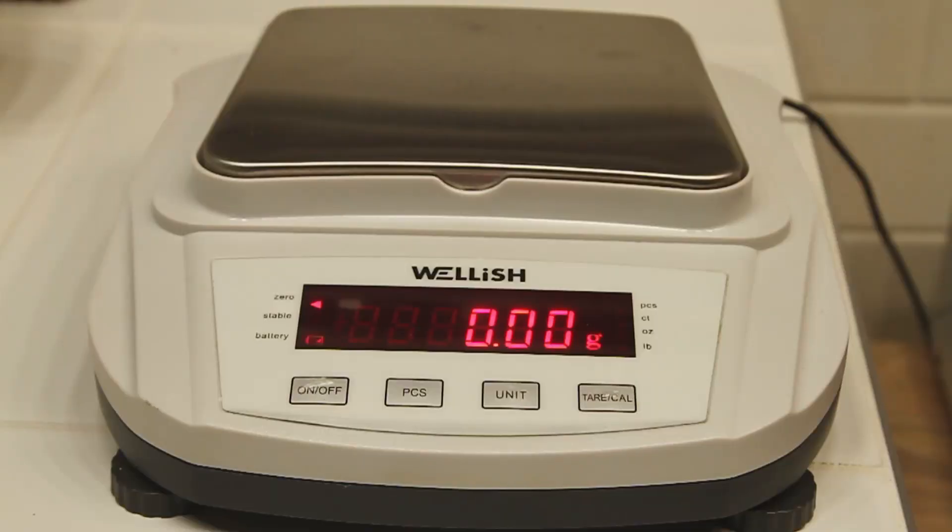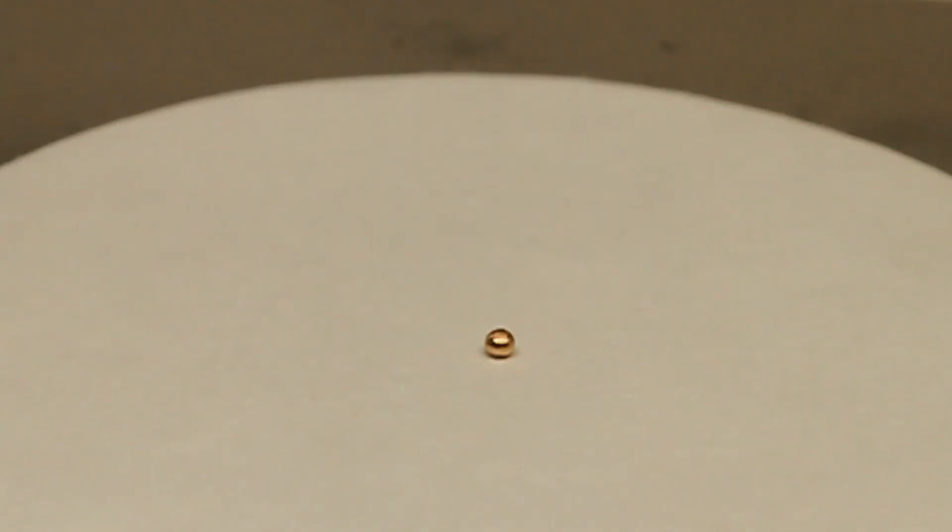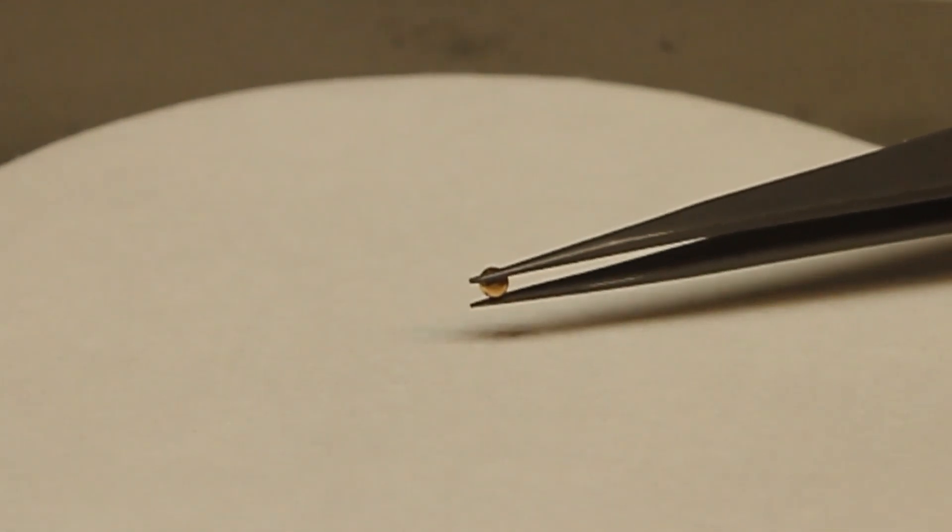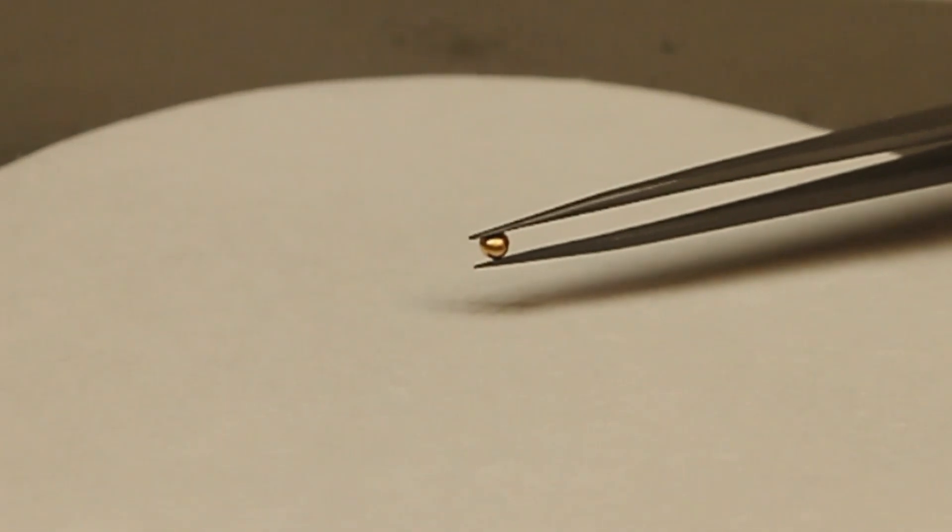And then here we have a final weight, 0.18 grams. I was expecting, you know, 0.25 or so, quarter of a gram. Better look at the piece. And we'll throw it in with the rest of our gold and we'll use it when time is right. Thank you very much for watching.